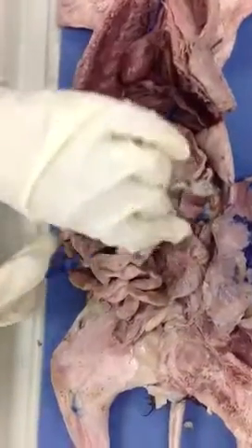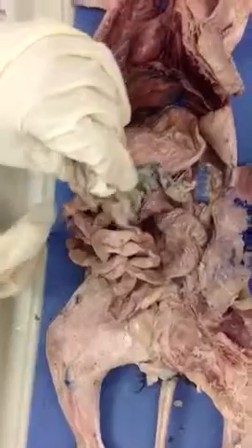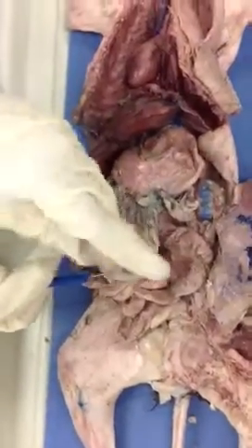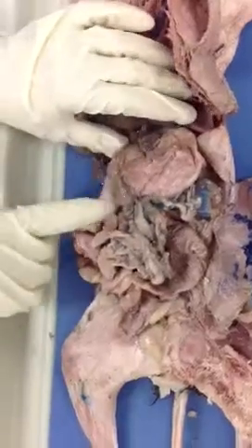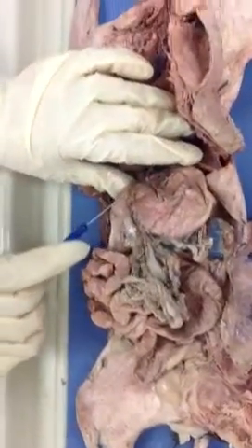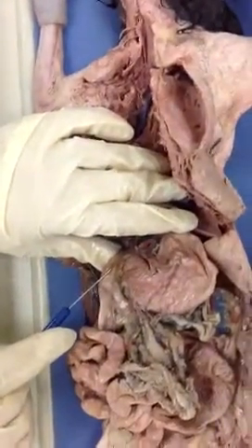Now this is another structure that I see is attached to the greater curvature. What is it? Greater omentum. Very good. Now here I see the first part of the small intestine. What is this, please? The duodenum.